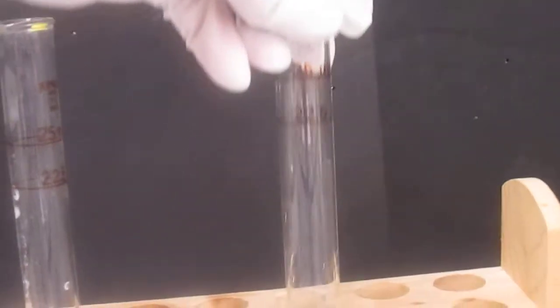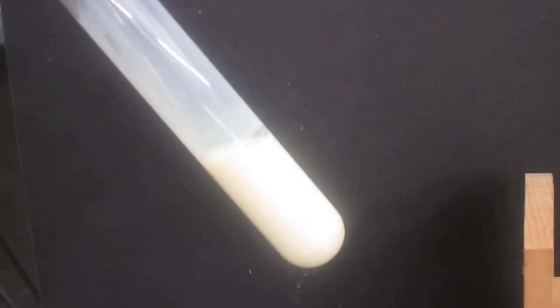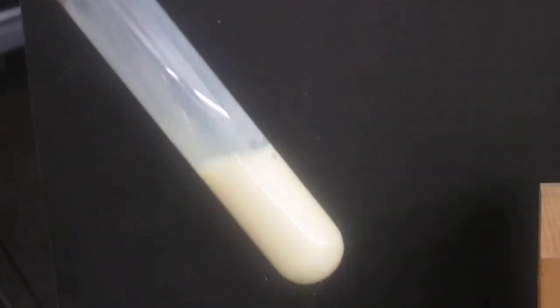And the last one, sodium iodide. Much more yellow color to it. Notice this one's not really settling out.